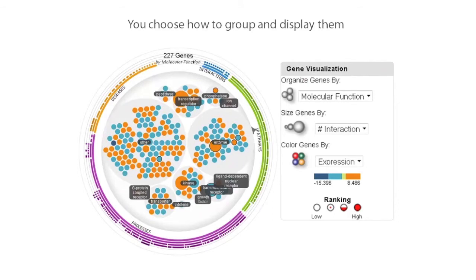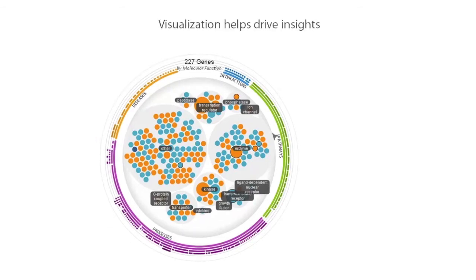You can use groupings such as association with disease, number of molecular interactions, cell location, expression change, and pathways or biological processes the genes are involved with. Changing the way you visualize this information can lead to new insights and can help you quickly surface interesting leads to follow up on.